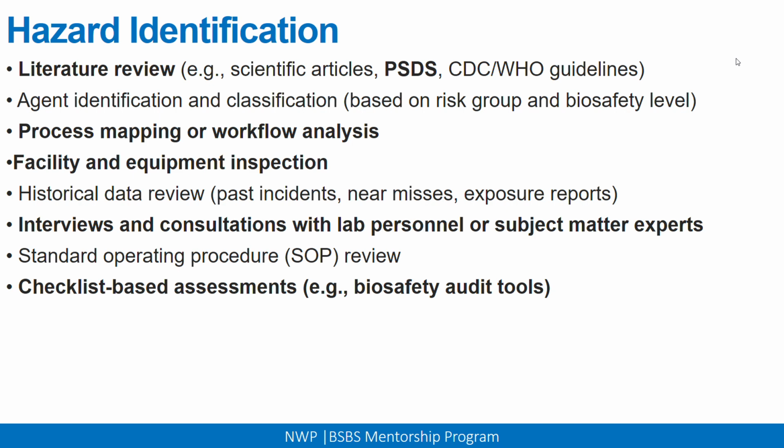Checklist-based assessment. Under checklist-based assessment, all you need is a biosafety audit tool or checklist, which checks certain areas about the procedure or about the agent, and through the checking or ticking of certain boxes, you'll be able to deduce the likelihood and consequence.